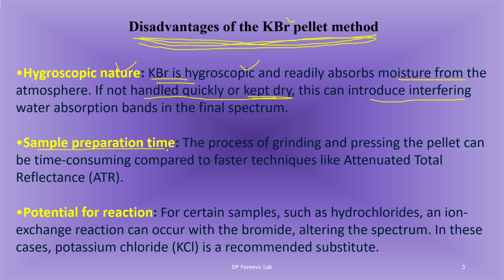Sample preparation takes time. For making the KBr plate, manual preparation is required, so it takes time. Suppose for making one KBr plate, you require about 5 to 10 minutes. So naturally this is time consuming.